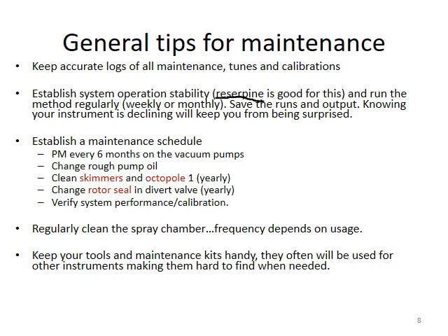will give you some good indication on the performance of the instrument. So you can use this well-set method to monitor the performance. Usually you can do this on a monthly basis. If you know your instrument well enough, you will not be surprised someday when the performance deteriorates.